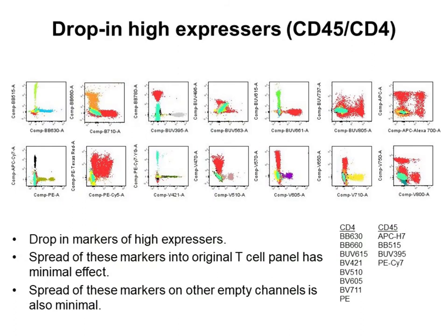I think what we can see from this result is that we have come out with a core panel that gives you a very good idea of which highly expressed marker you can use, but also, in terms of the markers that are lowly expressed, maybe where they can be fit.